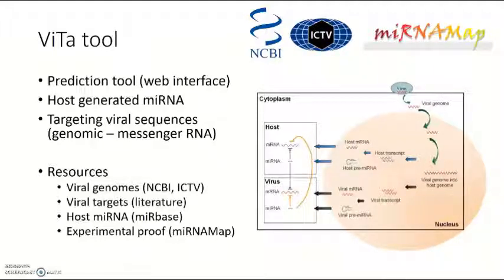It aligns the host-generated microRNAs on possible viral sequences. Do know that this is a prediction tool and this may not always be what occurs in a real-life situation. Thus, the in silico approach may vary from in vitro and in vivo approaches.